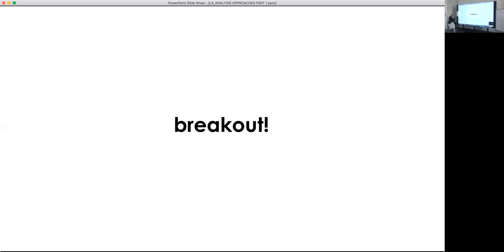Yep. I think that it's hard to estimate how much we should use, how much should be the area of smoothing, how much we should go for such type of reducing the noise, and maybe the proper approach is to go for it and to understand whether we can interpret what we obtained, or whether we should reduce the noise more.